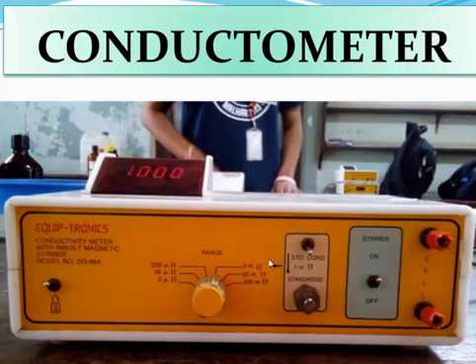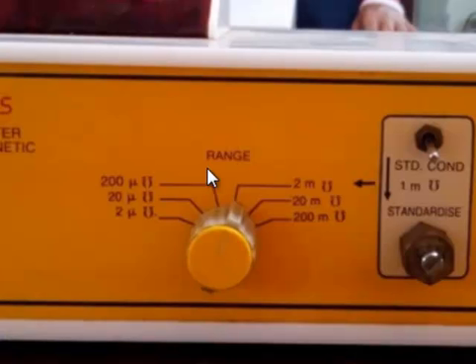So this is a simple conductometer in front of you all, and the probe will be dipped into the solution whose conductance is to be determined. In case you need to stir your solution during a titration, then there is a magnetic stirrer available, and in that case the solution to be stirred will have to be kept on top of the conductometer. This is obviously the on-off switch, and this knob represents the range in which the conductance reading can be taken.